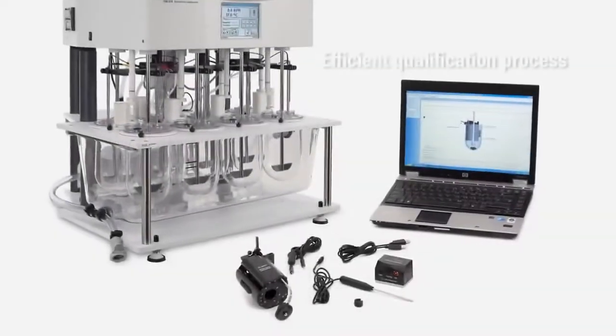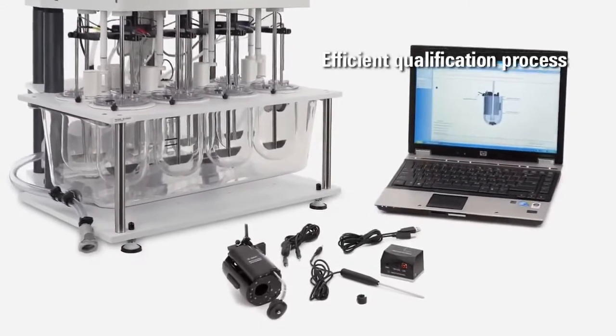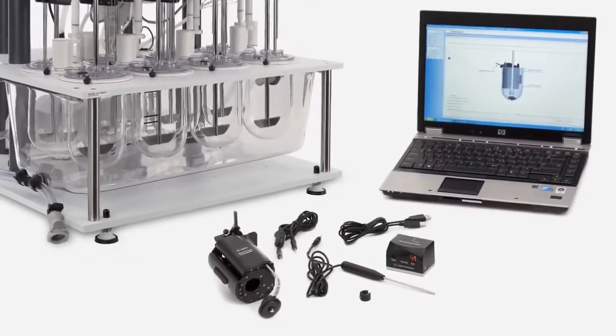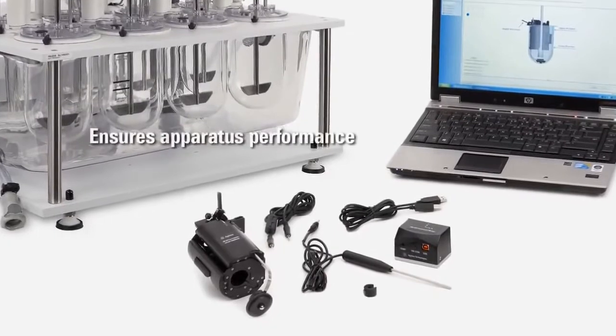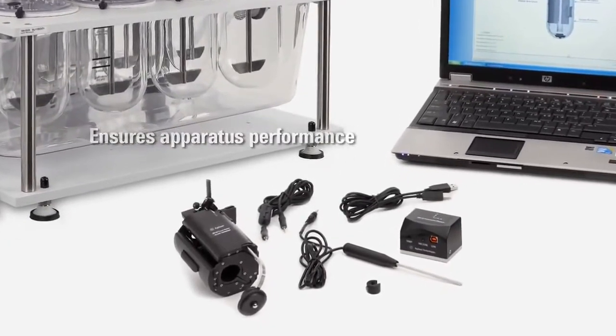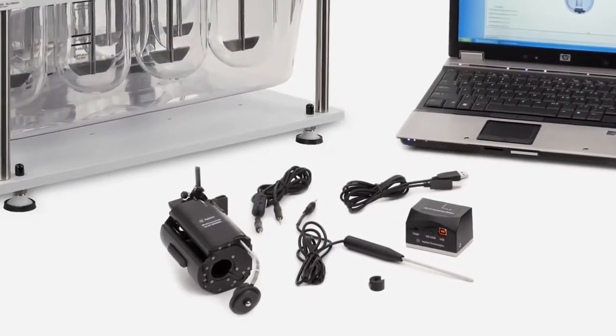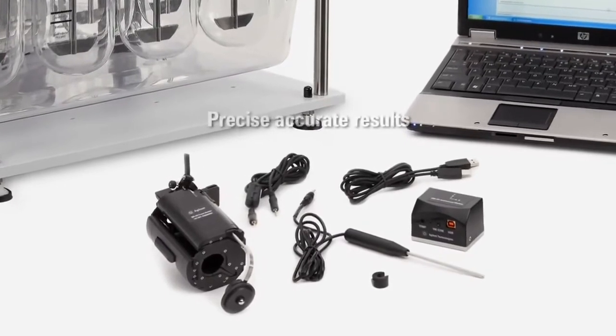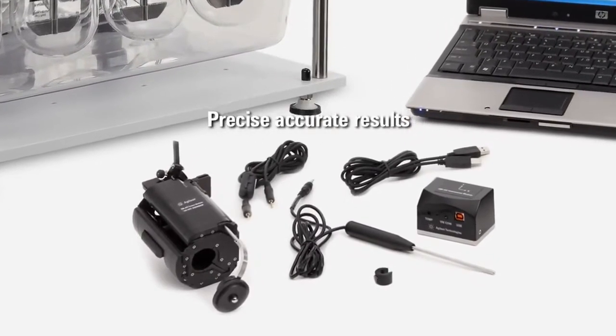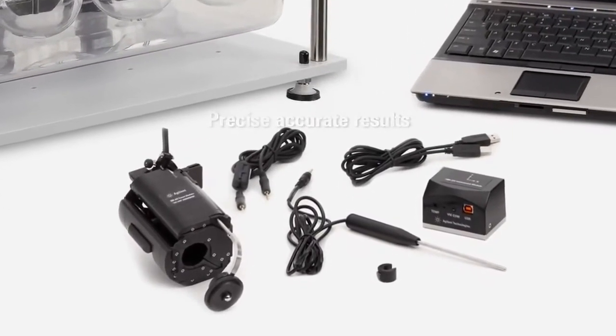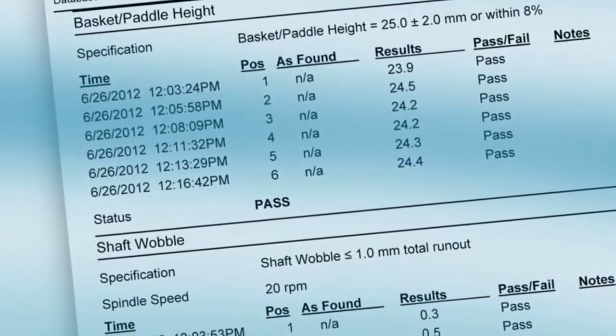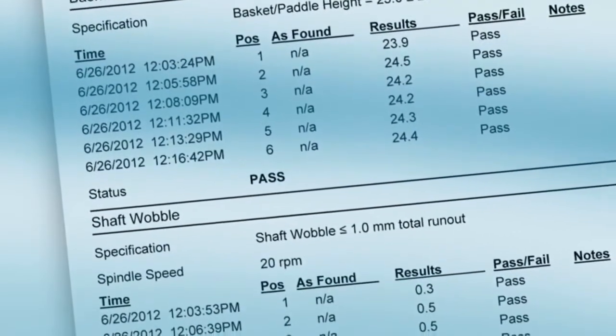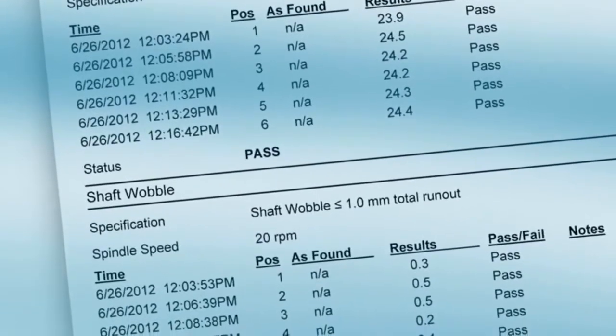Increasing productivity and ensuring compliance are essential to maintain a CGMP environment. In as little as 30 minutes, the 280DS can reliably verify proper working order of any apparatus one and two instruments with an open head design, as well as assist in failure investigation when results do not meet expectations.